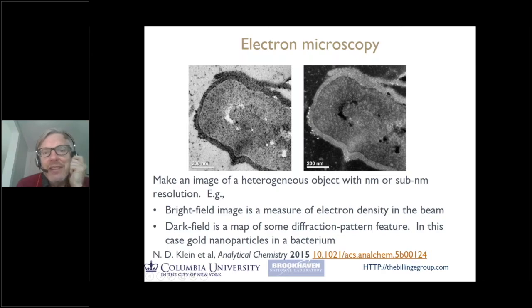And this is really measuring electron density as well as I understand it. And some of these black dots are because the sample makers, this is not my work, the reference is down here, introduced gold nanoparticles into this material. So some of these black dots are gold nanoparticles. They're regions of high electron density, and the question is which.